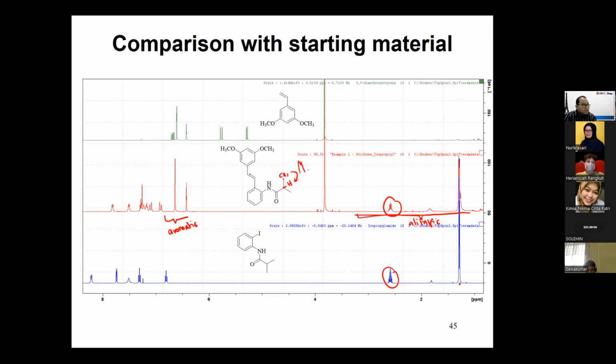And of course, if we assume this kind of compound, if you calculate the J coupling, you can see these very nice, symmetrical shapes. You can calculate the J coupling. The J coupling is around 16, yes, and you have to calculate after this.